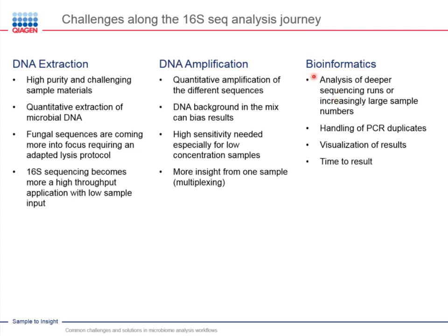Bioinformatics is important because you have to analyze more and more data. You have a higher sequencing coverage. You multiplex your samples so that you have 96 or sometimes even more samples per run with different barcodes on it. And in addition, you want to get all artifacts removed which are coming from your workflow. So ideally, PCR duplicates or something in this regard. You need a good trimming of your results.